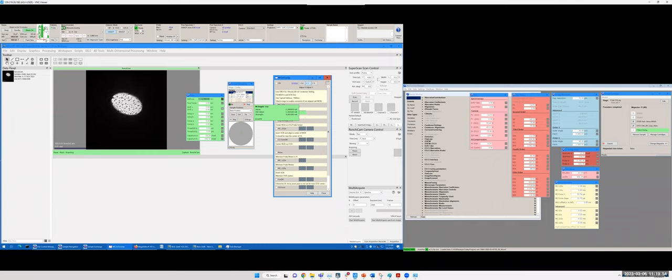There is a direction that is close to this way. This is the X direction of the monochromator. So we want to make sure it is not moving along this direction. You can see it's moving perpendicular to this X direction. We don't care about that, so that's good. Okay, so we are done with this 11QX alignment.